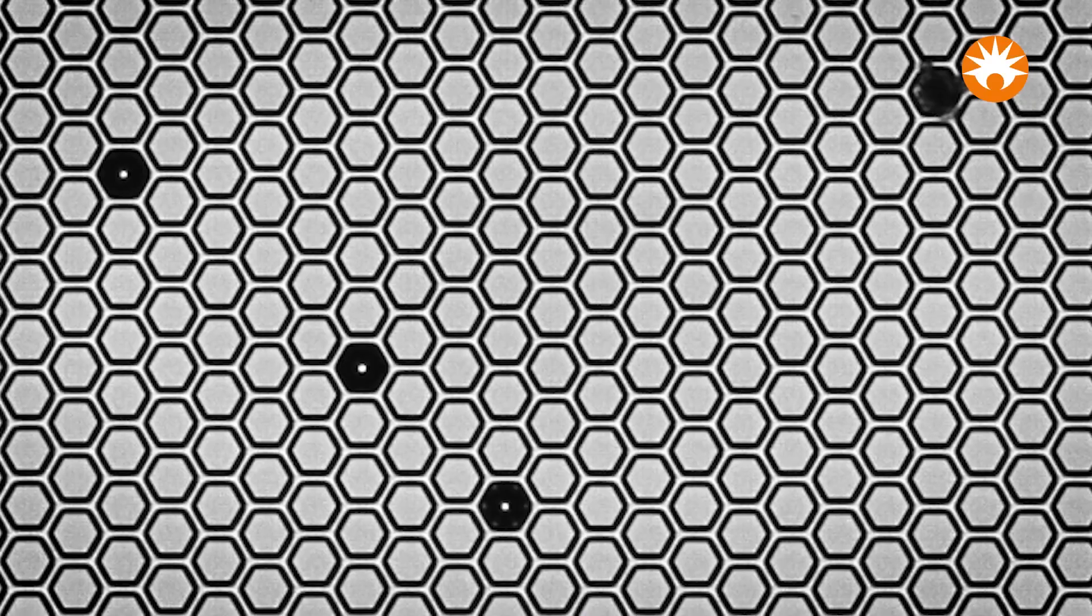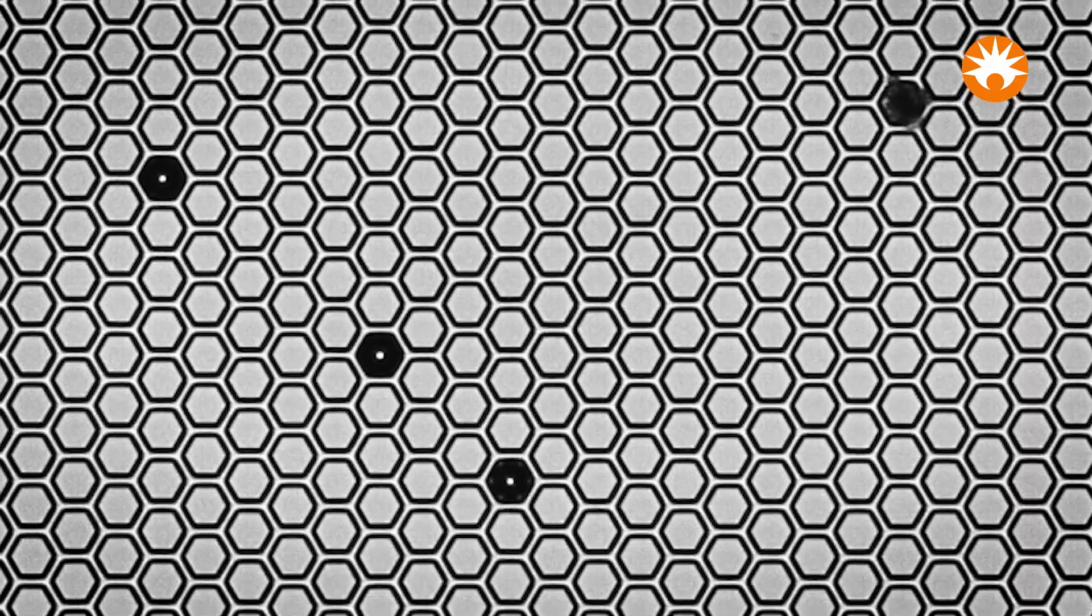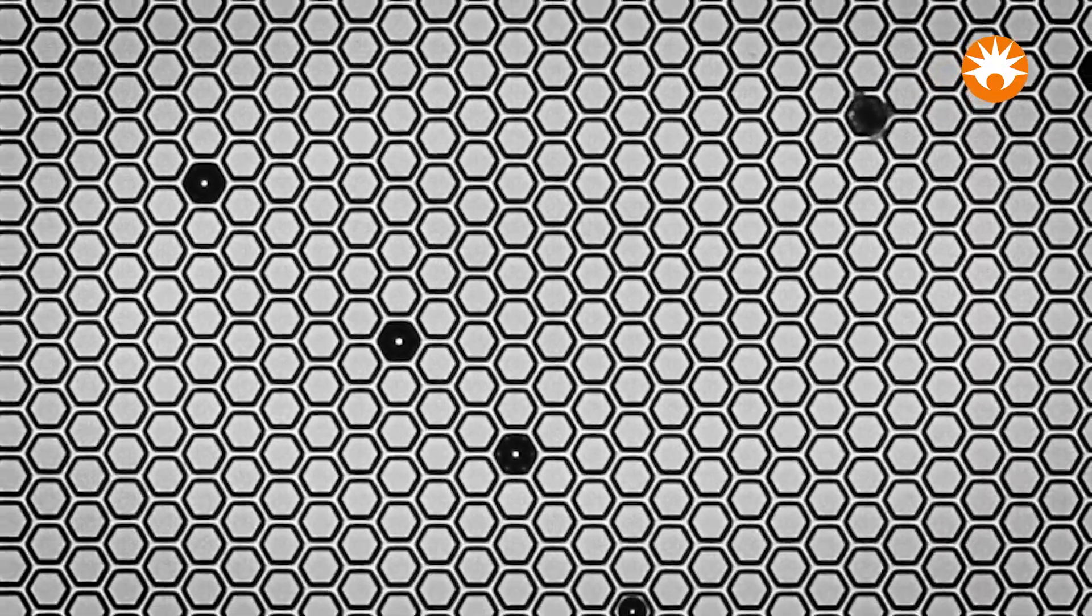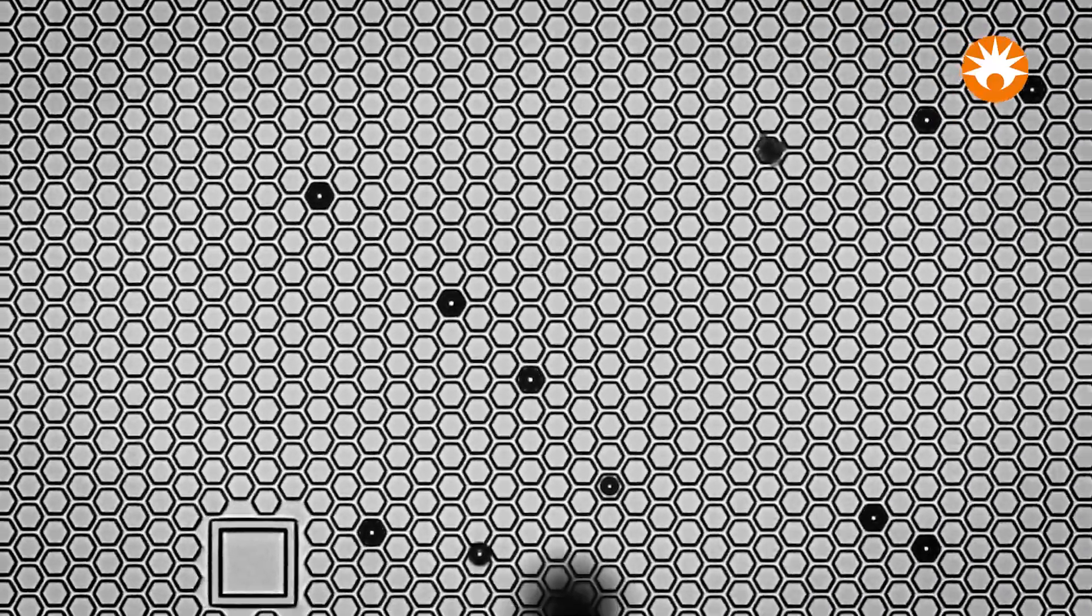After assessing these metrics, the cells are lysed and beads retrieved from the cartridge for further processing. The cartridge is scanned for a final time to determine how many beads were left behind.